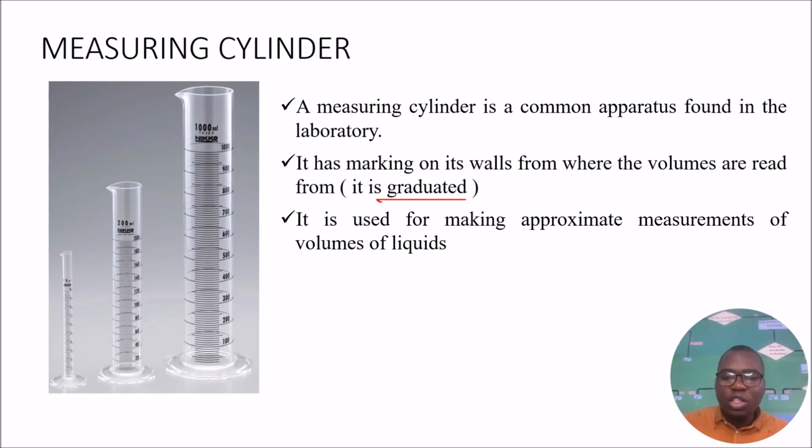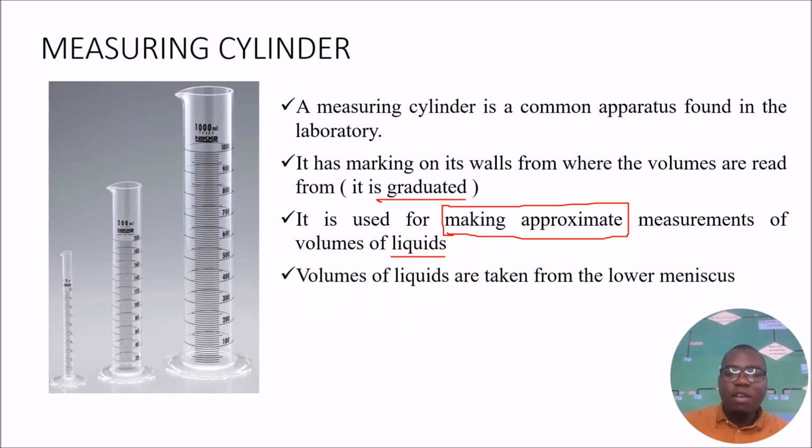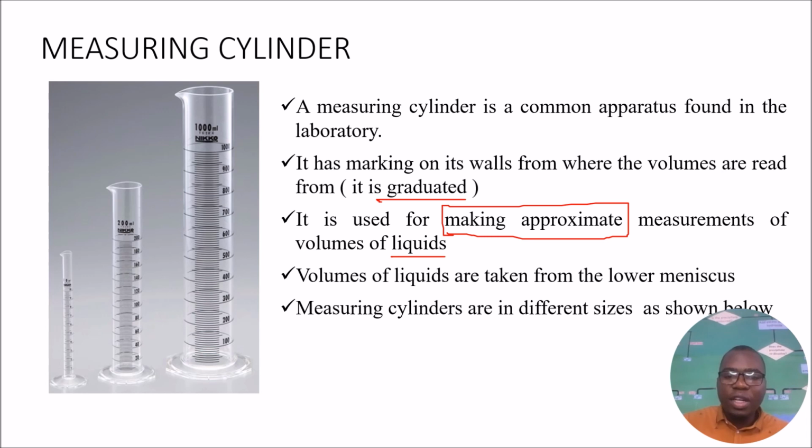So it is used for making approximate measurements of volumes of liquids. Please take note, it is used for making approximate measurements. Volumes of liquids are taken from the lower meniscus, as earlier discussed. Then measuring cylinders are of different sizes.